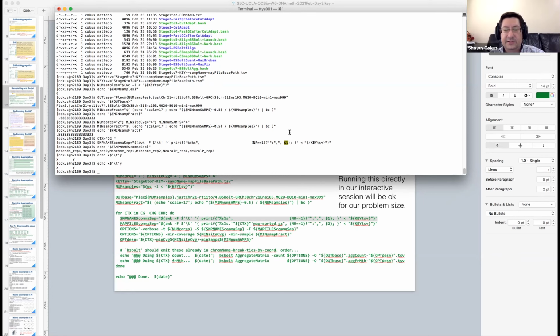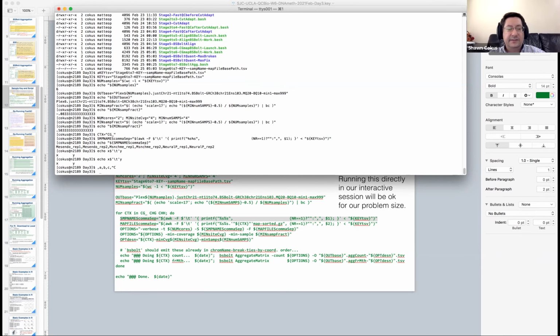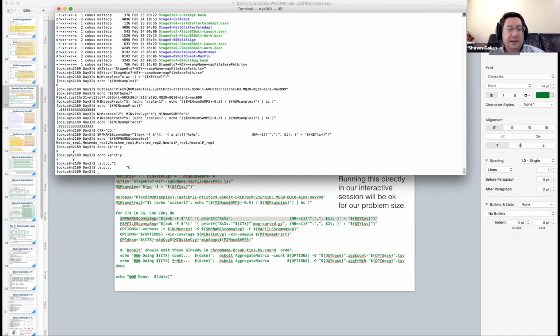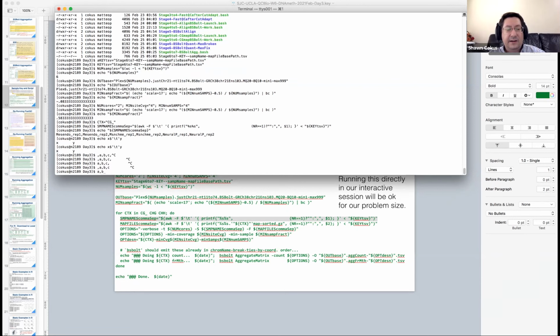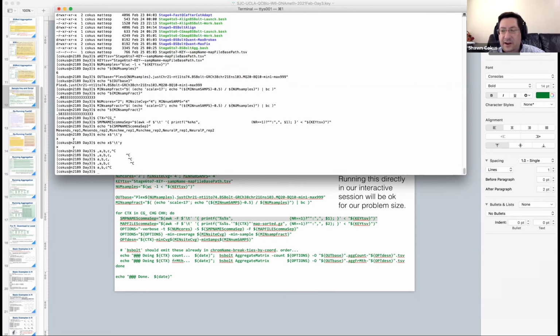So yeah, $1 is the first tab separated column. How do I get the comma separators right? Because I don't want this, right? Oh, sorry, the Control C is confusing you maybe. I don't want that. I don't want that. I don't want that. I want that, right? I only want the comma between the things, not at the beginning, not at the end.